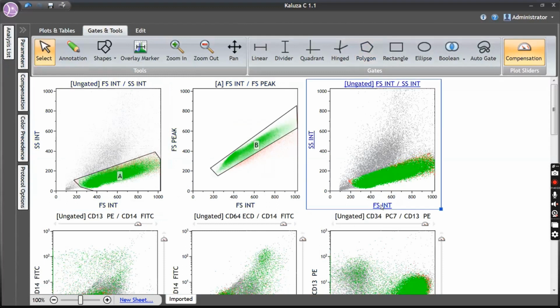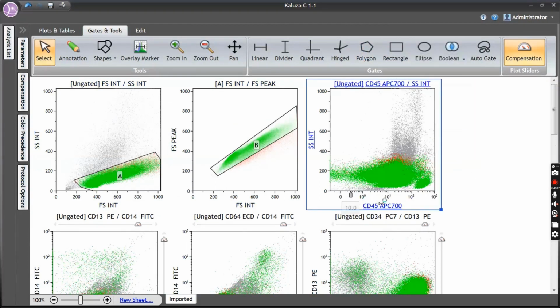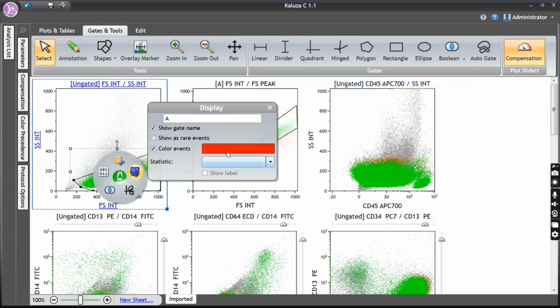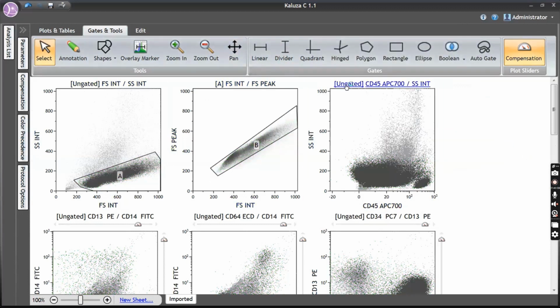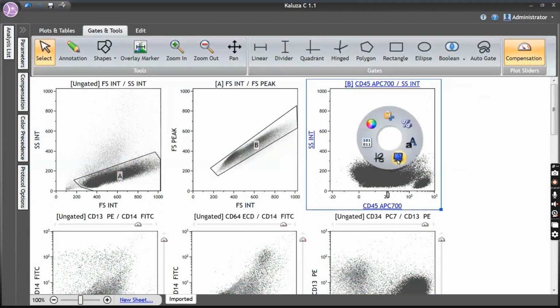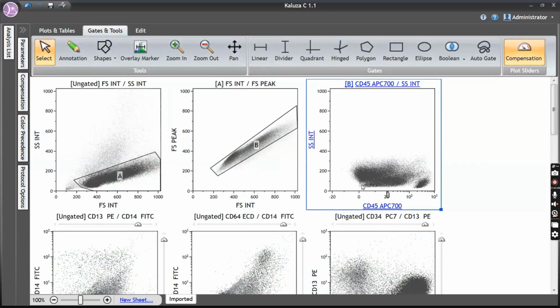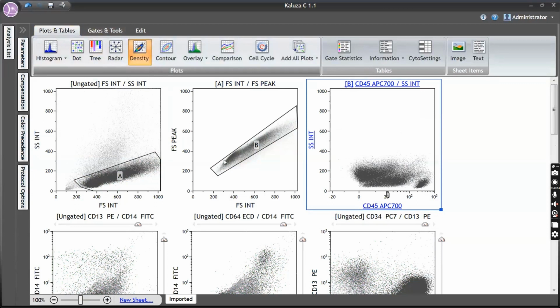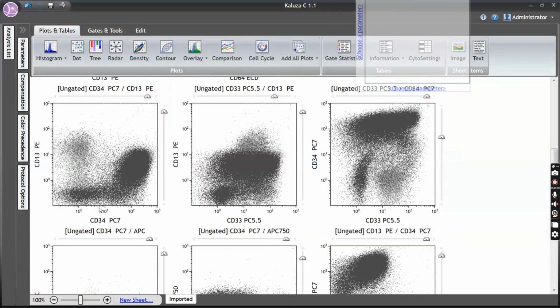Right. Then side scatter of CD45. So this is how it is looking. So let me click onto our standard colors, and I would also like to take up a density plot for seeing. Now I can see here this case has lymphocytes, and there is a CD45 negative to dim population, and I can see roughly there are two clusters, but with this dot plot I'm not seeing it so clearly. So let me bring in a density plot for better discrimination, for better clarity. Okay. Now I've added a density plot.